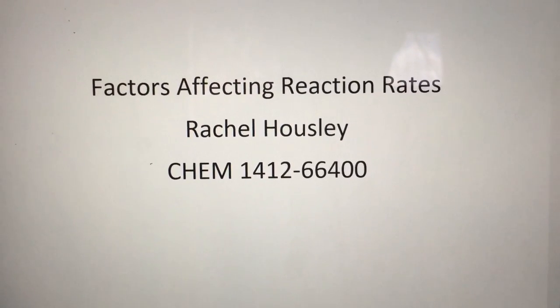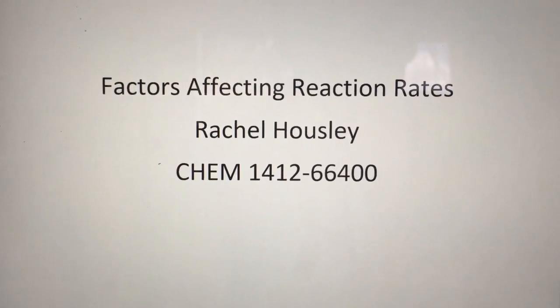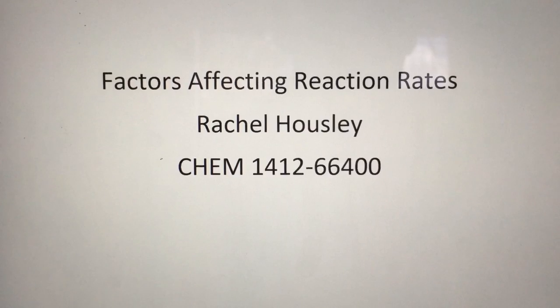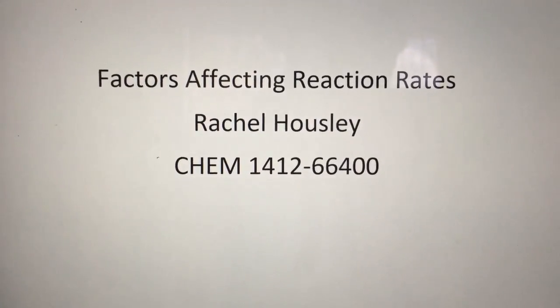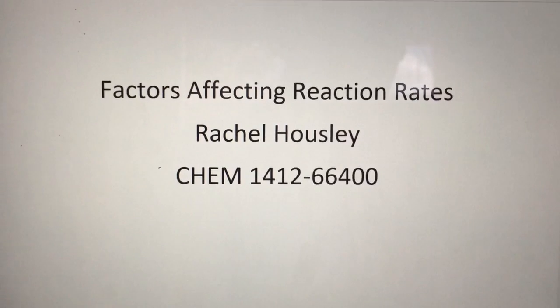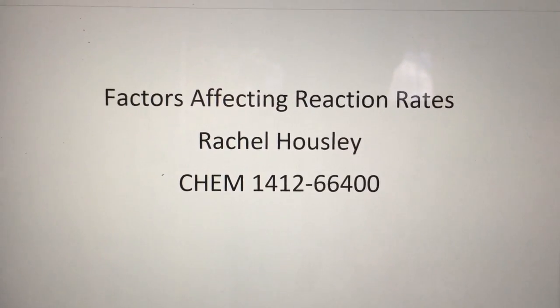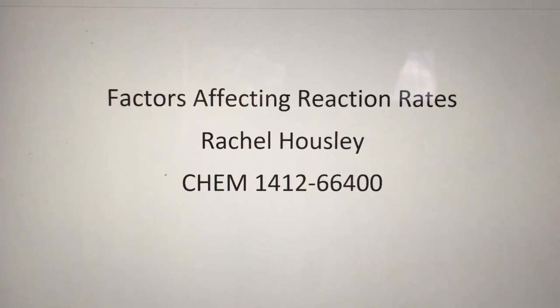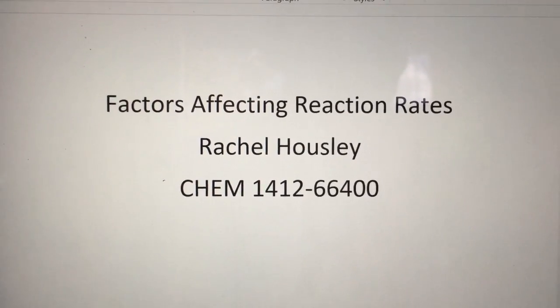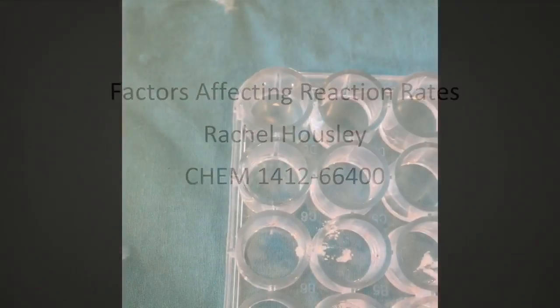So this lab's purpose is to observe and explain the effects that different variables will have on a reaction rate. And for this example, I will be doing the iodine clock reaction. The effects I'll be looking at are concentrations of different reactants, temperature, and adding a catalyst.